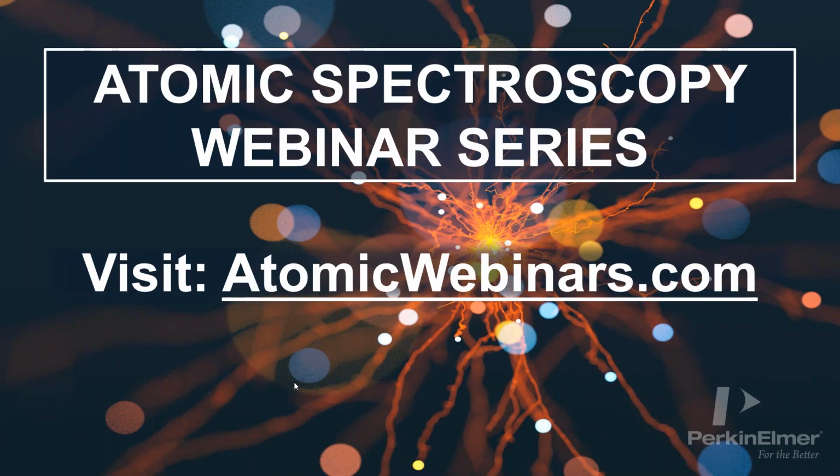Exactly. There's always some compromise, but, I'm not a cell expert, the nice thing about cells is you can do those rinsings, right? So you can rinse the cells, as long as you keep them safe and intact. You can rinse them to an extent to get rid of some of that metal that could be dissolved around it, which is nice. Yeah, absolutely. So, nanoparticles we just dilute. Cells you can wash, kind of, right? So, okay, then next question.